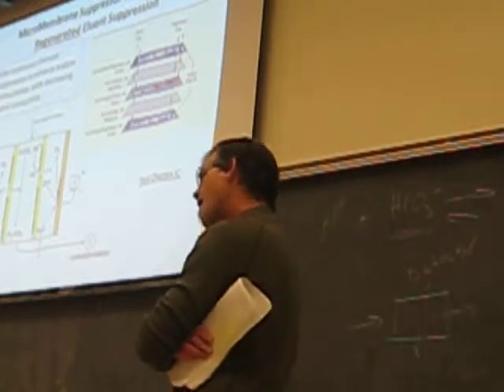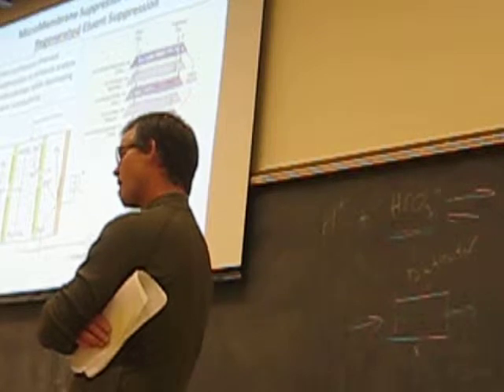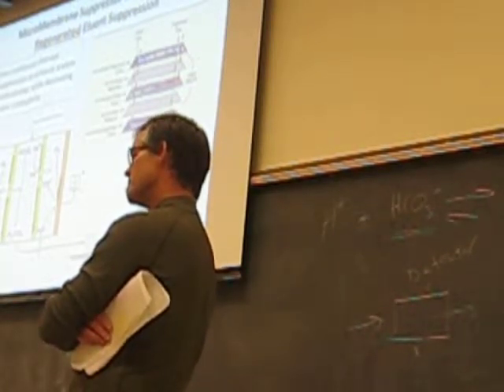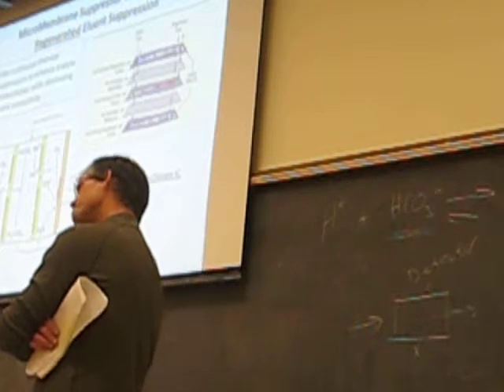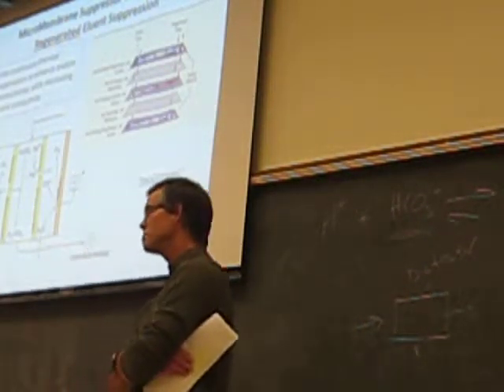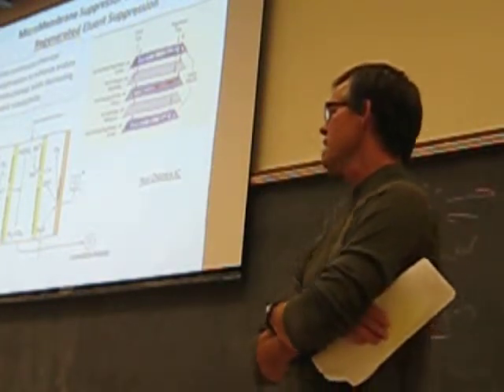So when you go to the column, do the anions bind to the mobile phase? When you go through the column, the anions are in the mobile phase. Yeah. So I'm not sure I'm following this. Okay, so why? Well, that's an important thing. Why is it that you are not altering the levels of other anions in there?